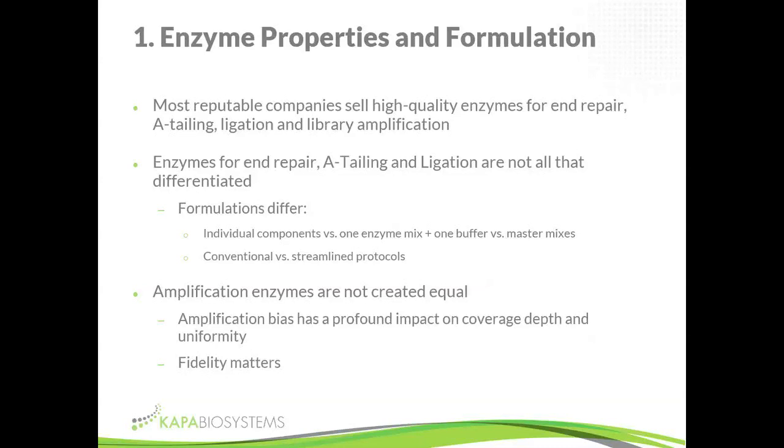Then fidelity is important. Everybody uses high fidelity enzymes for library amplification because we are sequencing individual fragments, the clonal populations of these individual fragments. Fidelity is less of an issue in the context of library amplification, but just remember that you don't want to amplify libraries with Taq and introduce a whole bunch of substitutions and errors during a library amplification reaction.